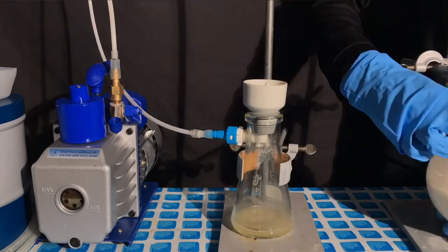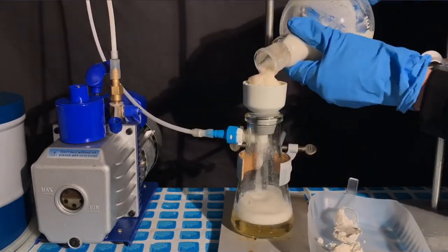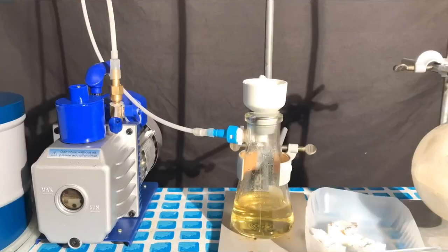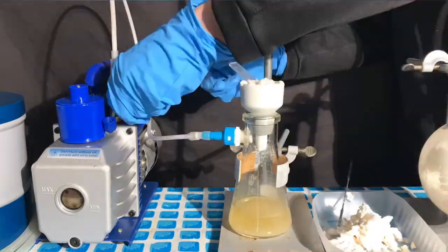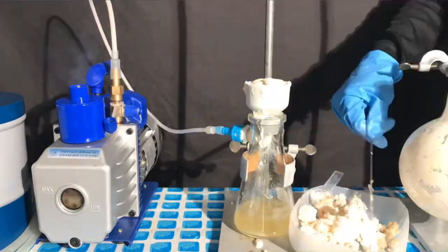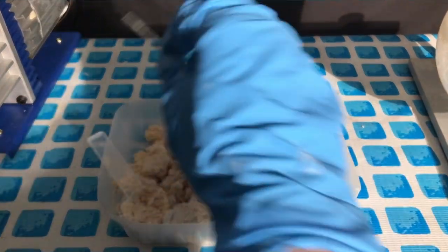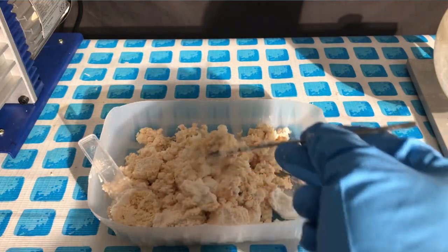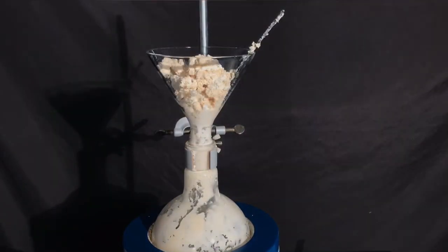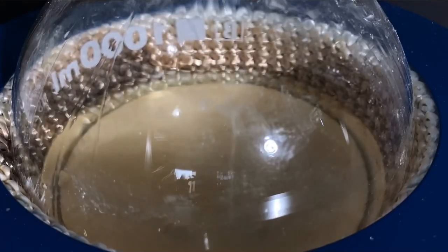A vacuum filtration was carried out to get rid of the majority of the water. I should definitely get a bigger filtration funnel and a bigger flask for this kind of stuff. Once the filtration was finished, we were left with this crude aspirin, which does not look pure. Everything was put back into the 1-liter round bottom flask, and as a solvent, 150 milliliters of 96% ethanol were added.